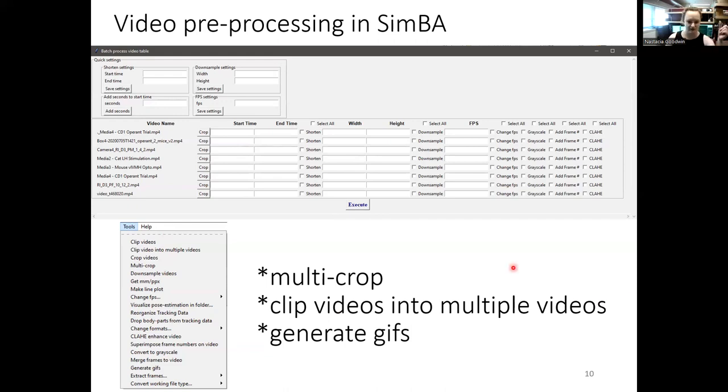So I split my 12 active trials into 12 videos, and then generate little video examples. Basically I take my raw videos and clip them all into just the things that I want DeepLabCut to see. And for cropping videos for DeepLabCut, you want to crop your videos as small as possible to reduce computational expense. It goes a lot faster if you have a smaller video.